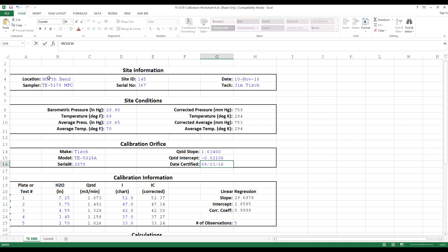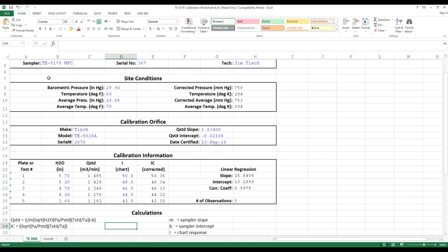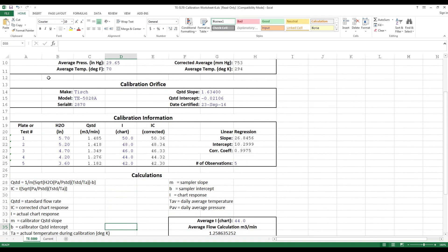Go over to the H2O manometer reading. The readings were: 5.7 the first one, 5.2 the second one, 4.7 the third one, 4.2 the fourth one, and the last one was 3.6. Go over and put the corresponding chart readings: the first one was 50, the second was 48, the third was 46, the fourth was 44, and the last one was 42. The correlation coefficient is greater than 0.990, thus a good calibration. We did get all five numbers within the range for TSP, which is 39 to 60 CFM or 1.1 to 1.7 cubic meters per minute.